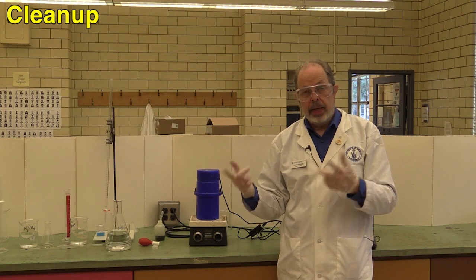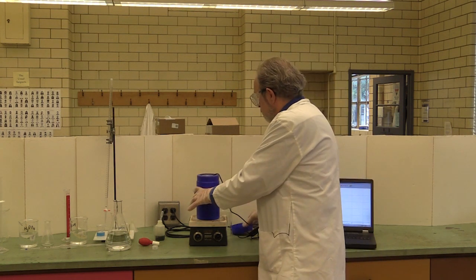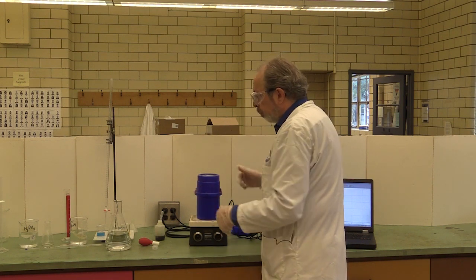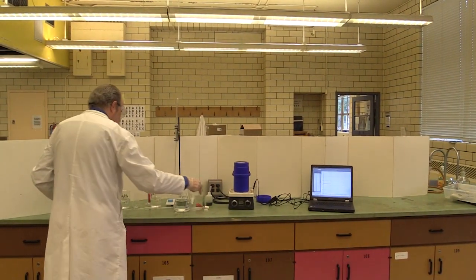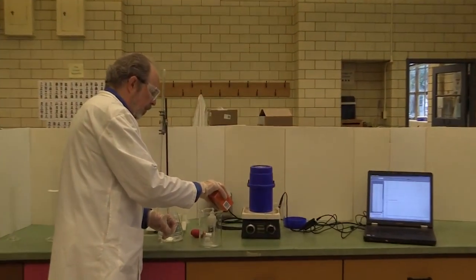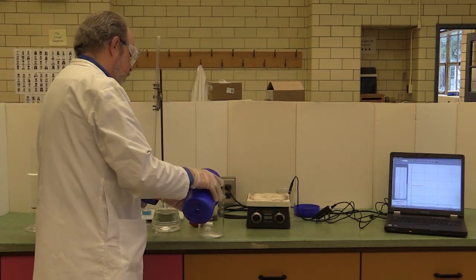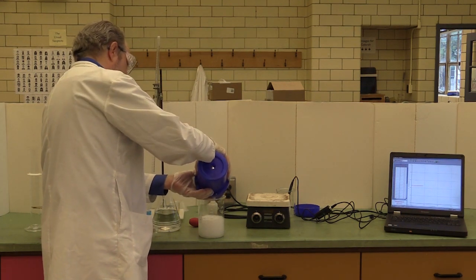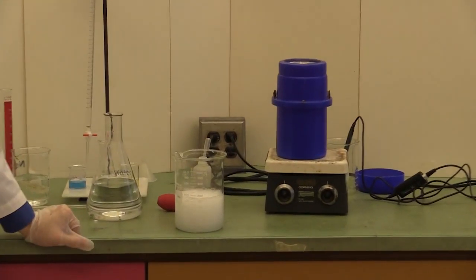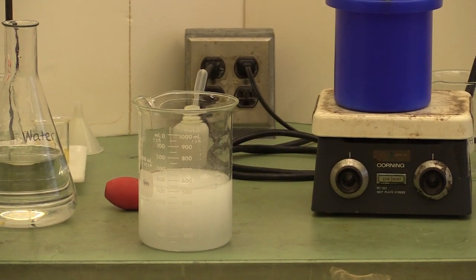Once you have finished each run, you will need to dispose of the excess acid. So take the lid off the calorimeter. Take the temperature probe out. And you'll be neutralizing it by using an excess of sodium bicarbonate. So we'll use a small beaker and about five mils of sodium bicarbonate. And then dump the contents into a large beaker. You wait until the fizzing stops and then pour the neutralized acid into a sink full of water, being careful that you don't throw the magnetic stirrer down the drain.